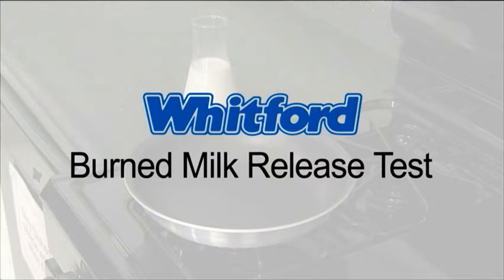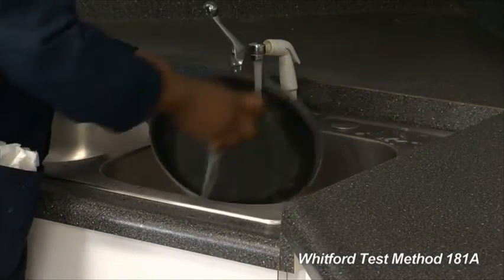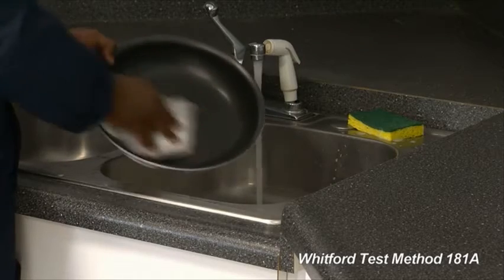This is Whitford's Burned Milk Release Test, designed to measure the releaseability of a coating. Rinse the test pan with hot water and dish detergent, blotting it dry.